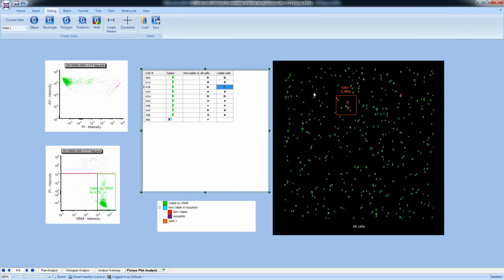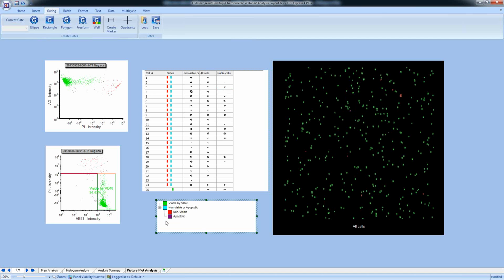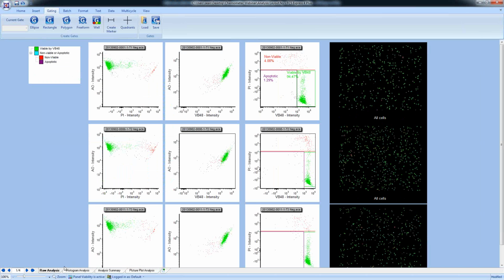All we are doing is going in and saying, where was the segmentation for this cell found? Anything that was found in what's called the segmentation mask, display that on the left in our data grid. So these are the actual images coming from this microscopic image. And that's what allows us to relate everything back and forth from single cells to dot plots to the actual image itself. So when you're in FCS Express, you have all of this power to work with these images.